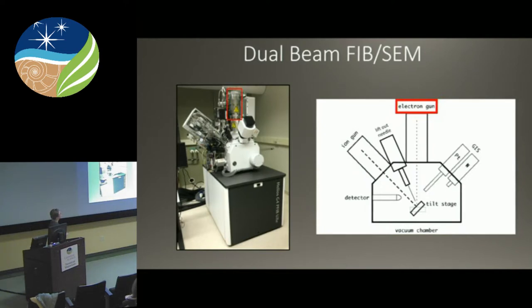So what's a FIB-SEM? Every FIB-SEM is a dual beam — it has a FIB and it has an SEM. Here's the SEM part, just like a standard SEM. This is our new FIB with her covers off. It also has an ion gun — that is the focused ion beam — at 52 degrees incident to the electron beam. It has a gas injection system with metallo-organic hydrocarbons: about 20% tungsten and the rest is hydrocarbons. A powder sits in a crucible; you heat up the crucible, it generates a gas that flows down a needle, and by rastering either the electron beam or the ion beam over that little gas cloud, you can deposit material onto your sample.